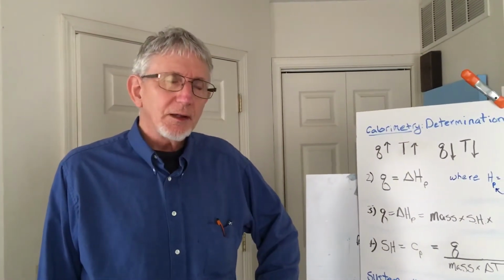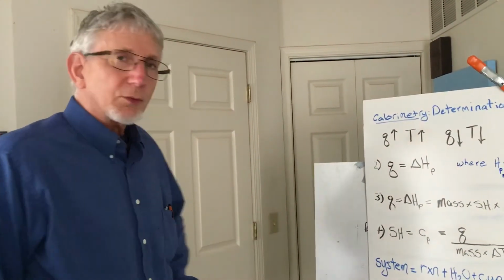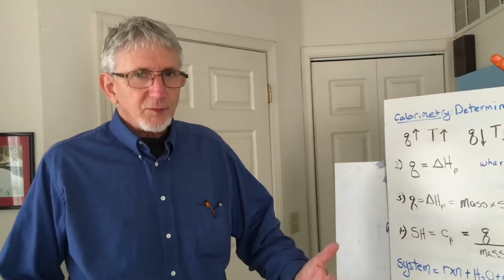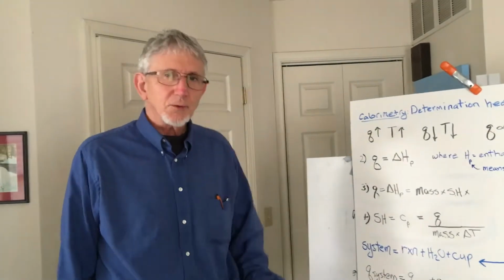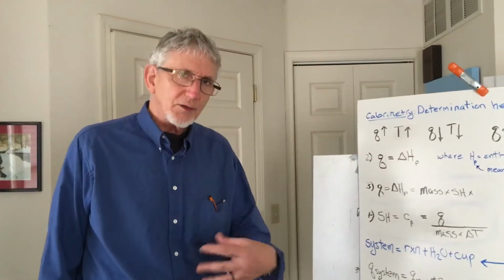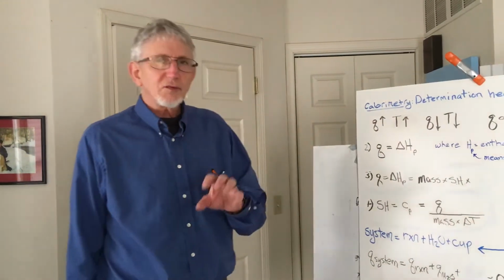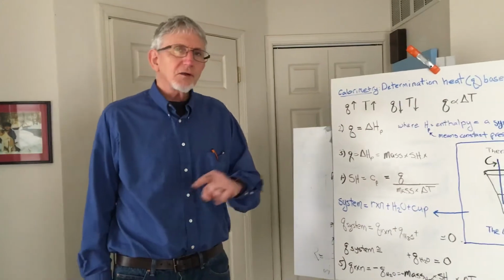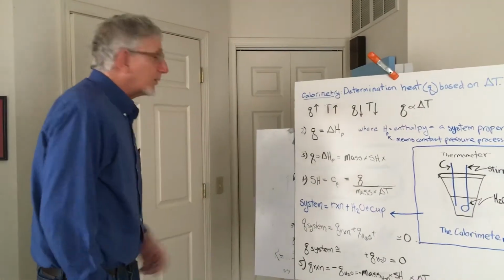This is a streamlined online version of that lab. And we're going to be doing calorimetry, which means we're going to be measuring the heat associated with various processes. What kinds of processes? Well, like a chemical system undergoing a chemical reaction, or taking a solid ionic compound and dissolving it into water to create a solution. We're going to use the science of calorimetry to determine the heat energy exchange between the system and the surroundings. And what is calorimetry?